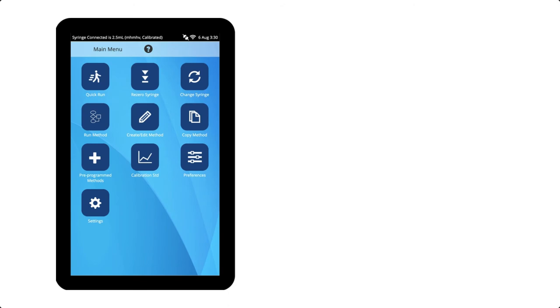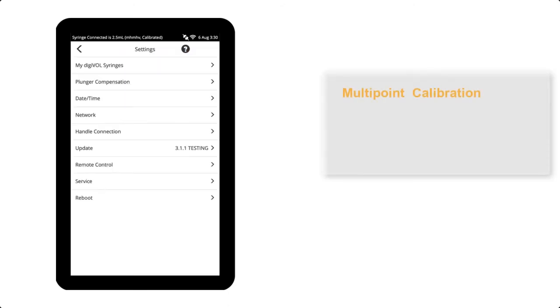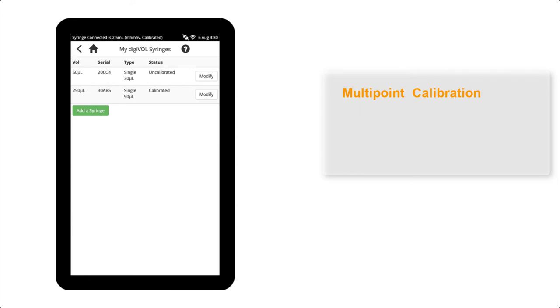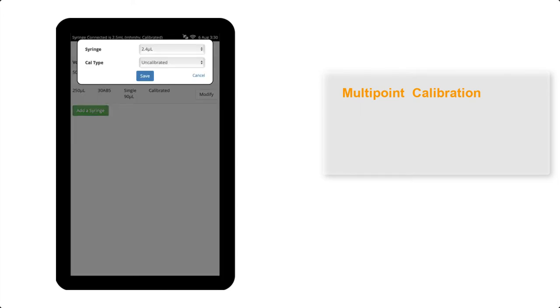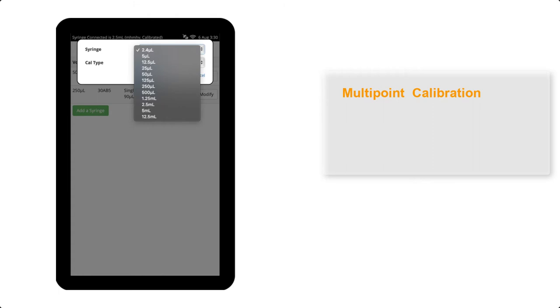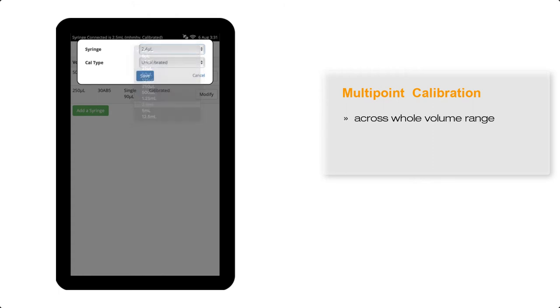To show you the multipoint calibration, I'll add a 2.5 mil syringe and choose multipoint as the calibration type. Multipoint calibration is used when you want to dispense any volume between 10% full-scale volume and the maximum volume of the syringe.